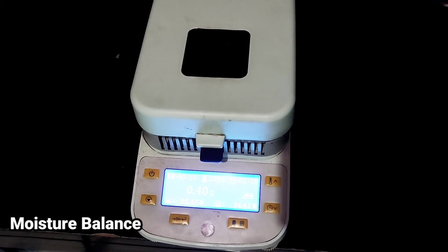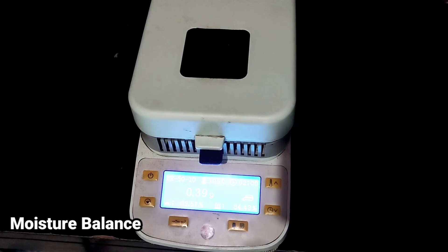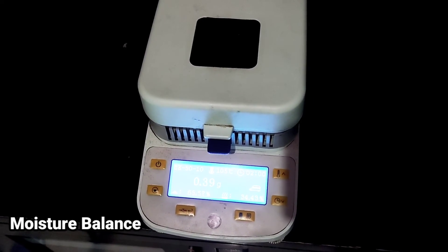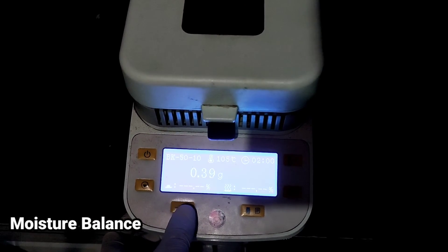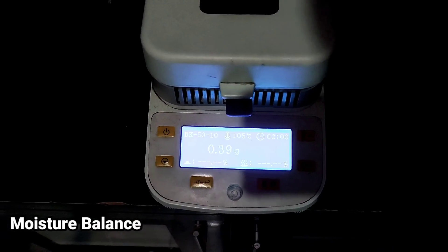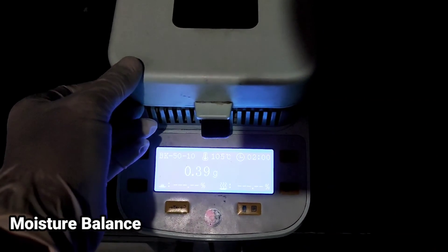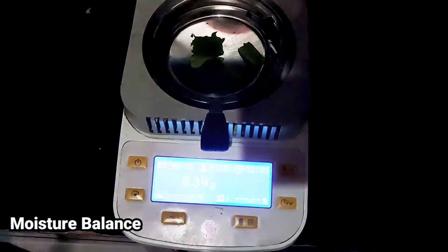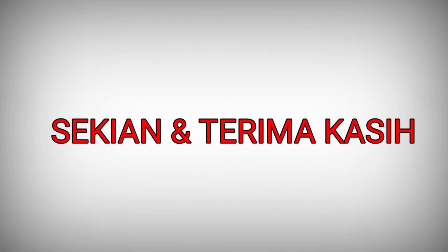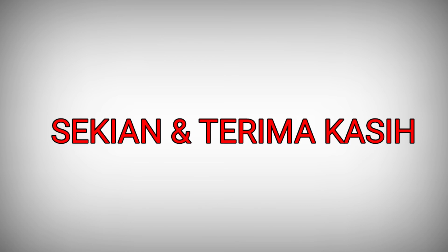Dengan ditandai bunyi alarm, berarti sudah selesai untuk pemanasan. Jadi kita bisa back, kita bisa buka. Sekian. Terima kasih.